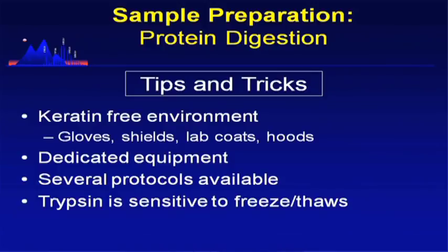And so in our lab, what we do is we have a hood that's set up just for protein digestion. And it's not a laminar flow hood or a cell culture hood. It's a regular hood, but it's a sort of contained space that we can keep clean. And so before we start digestions, we go in with a methanol Kim wipe and we dust, basically. You wipe everything down. You wipe the pipettes down. You always wear gloves. If you have long hair like me, I'm always shedding hairs, and I try and pull my hair back. But you have to just be really conscious of it.